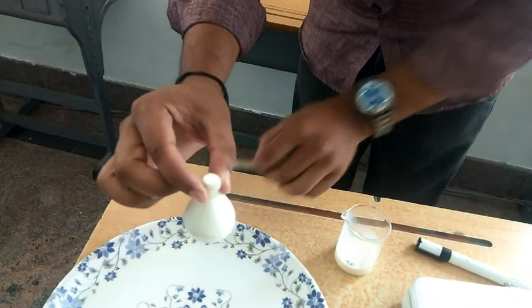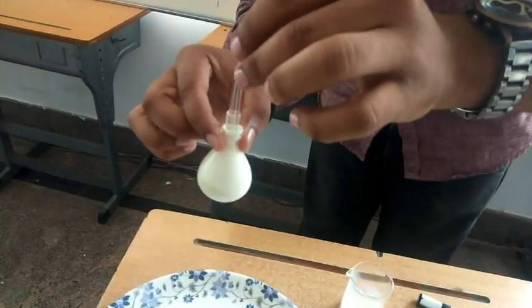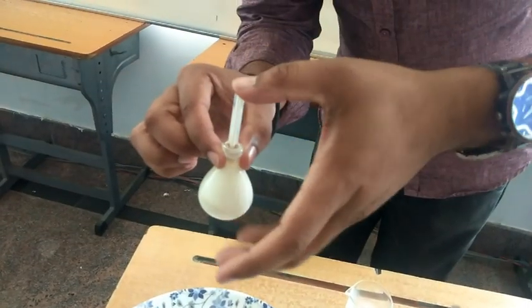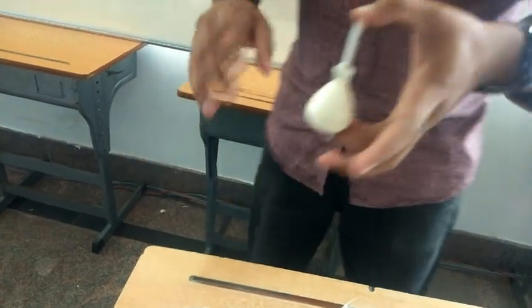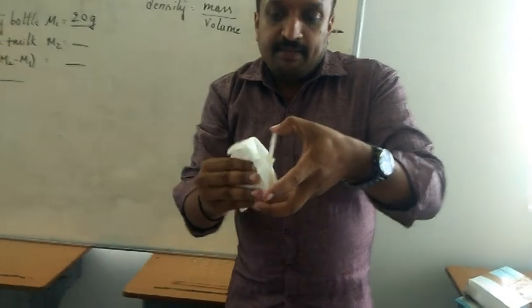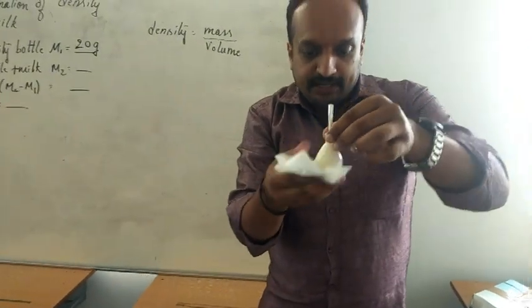Now I am going to use the stopper, the excess milk will overflow. Now I am having exactly 25 ml of the milk.